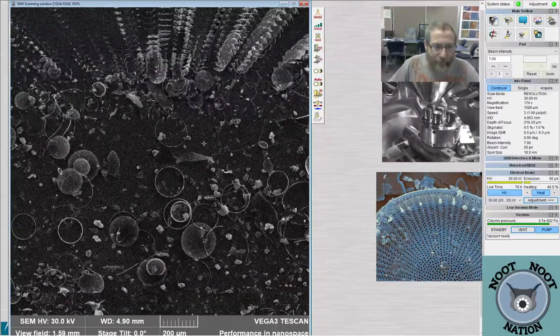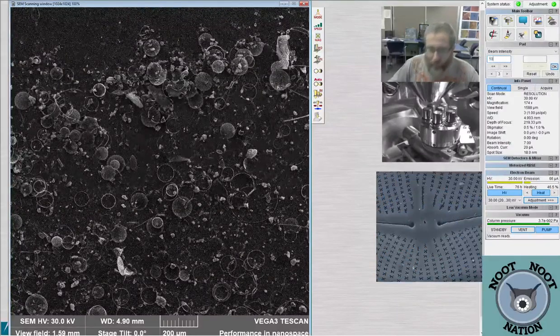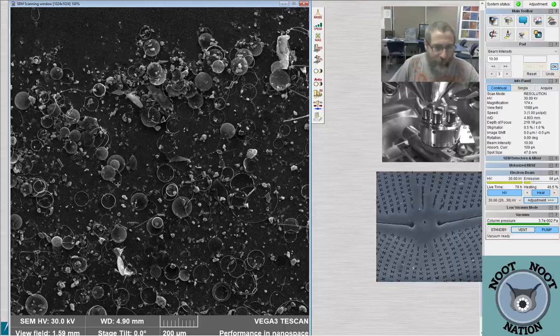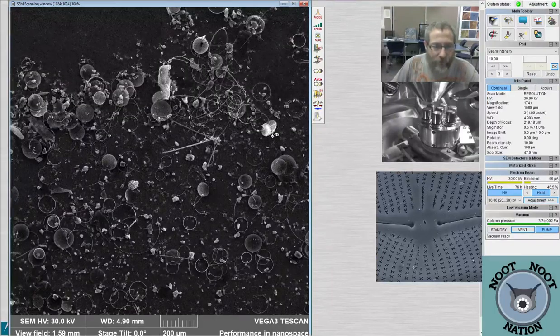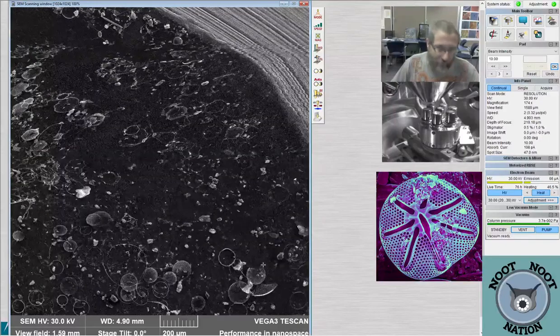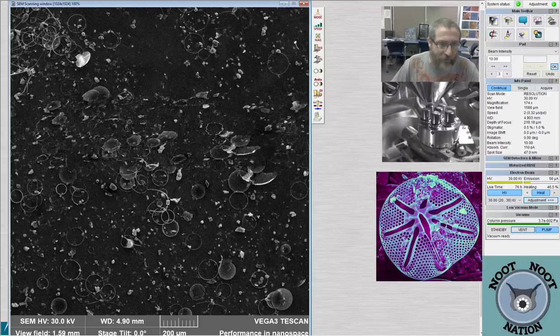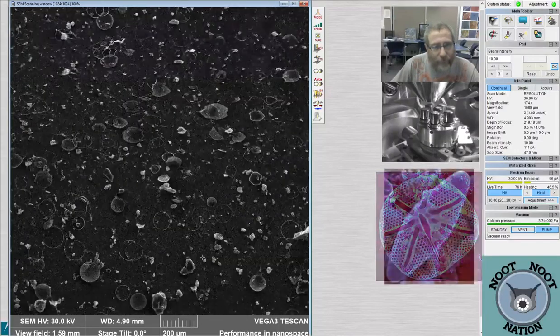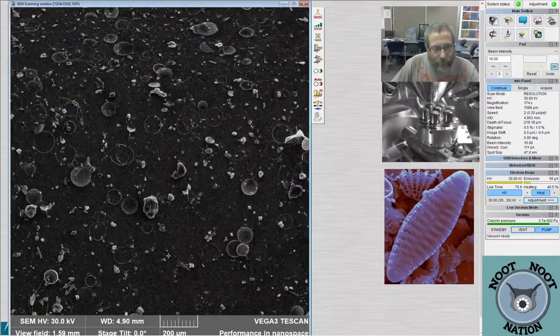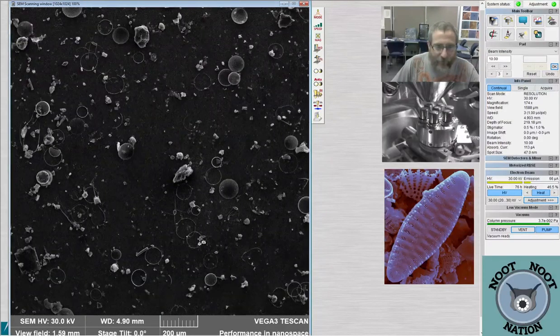And so we don't want the image to bleed too much. If I put it on 10, the image will look brighter, just the same way that the Sharpie would look bolder, but when I start to zoom in, you can't resolve as much of the image. So that's sort of like the pixel size in a way, although it's not perfect for that, but there's less bleed the tighter the beam intensity is. I know that's a lot of words for just one answer, but.